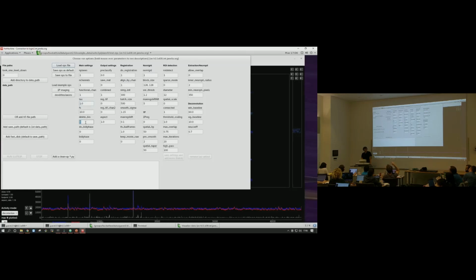So why would you change that? What should happen in the outputs that you would think, let me change my tau? Well, if you're in a well-defined brain area where you roughly know how things are, there should barely be a reason to change tau other than based on the GCaMP sensor: fast, medium, slow.